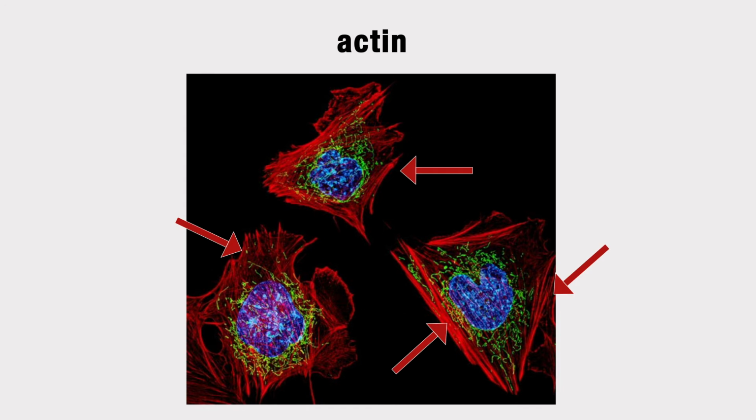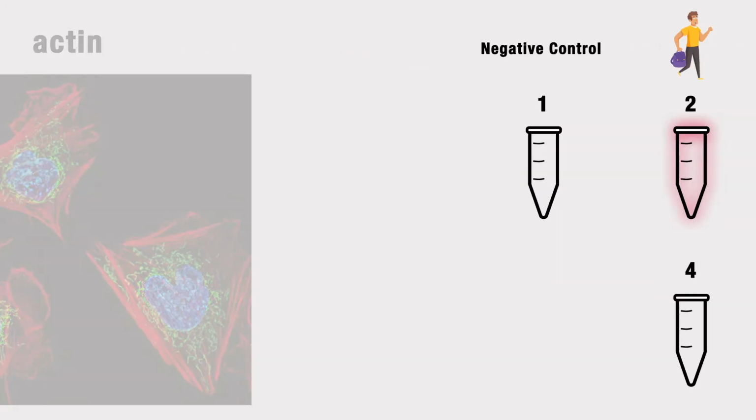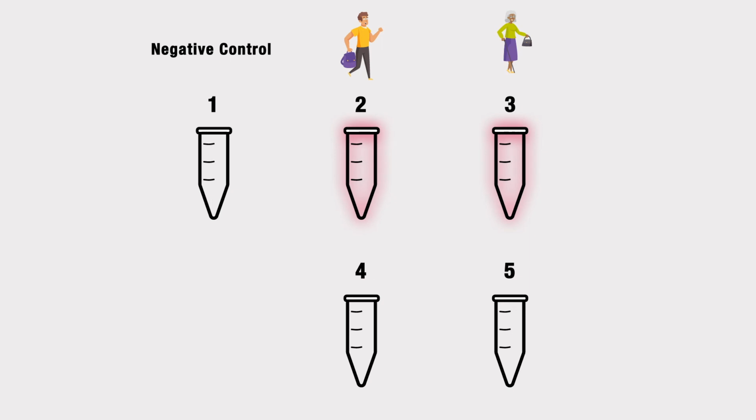I will explain in more detail later exactly how, but housekeeping genes serve as an important reference point for analyzing the expression of your gene of interest. The housekeeping gene also helps you understand whether something was off in your reaction. If you see dramatic changes in amplification of your housekeeping gene between each sample, that likely means that the reaction was flawed and your data won't be reliable. The fourth and fifth samples will show the expression of gene A in both our young and old donors.